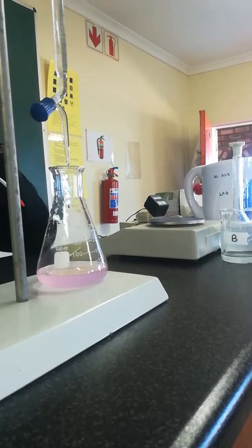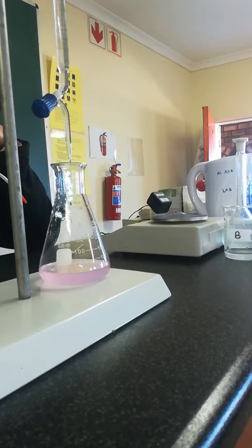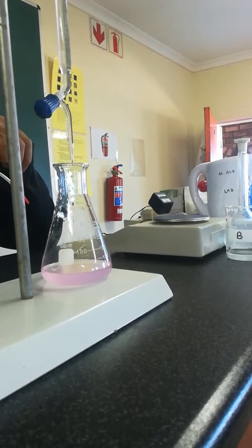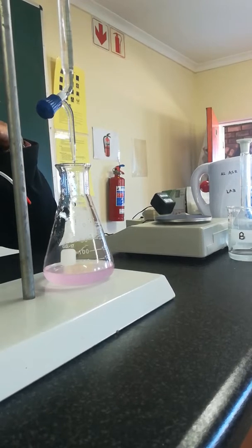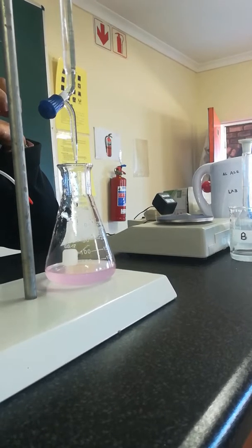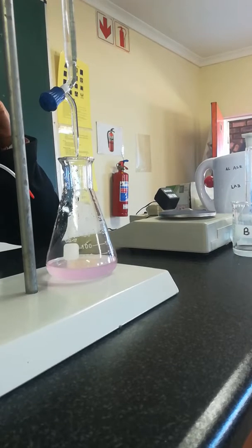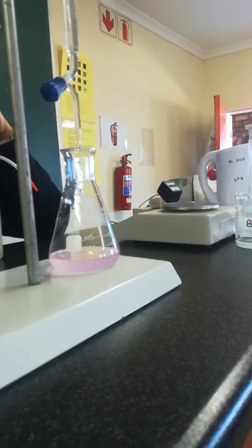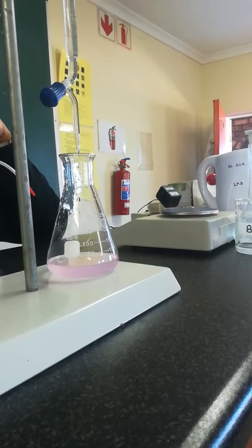Because now if I put more, it will turn pink. It's a pale pink. This is just light pink. But if I put one more drop, it will turn dark pink. So when it's almost neutral, it turns light pink. Then when it's basic, it turns dark pink.